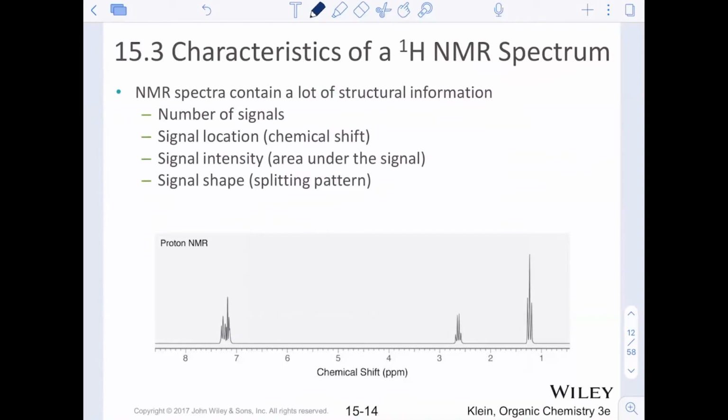Very detailed to run. So typically smaller benchtop NMRs are seen in organic chemistry labs. If you go into any sort of graduate program or higher research, you might find an actual huge NMR that's like the big cylindrical thing that we saw in the picture from the textbook.